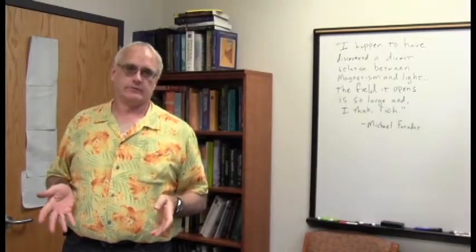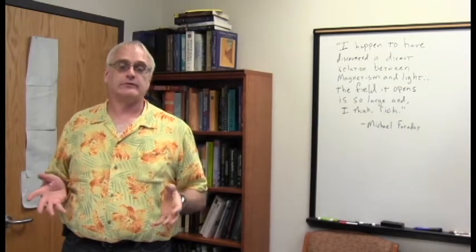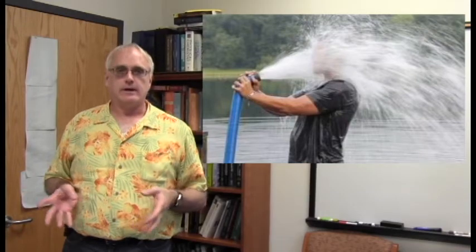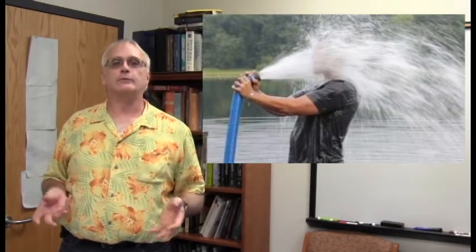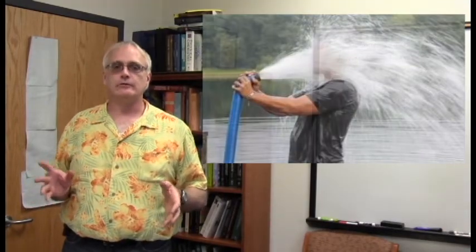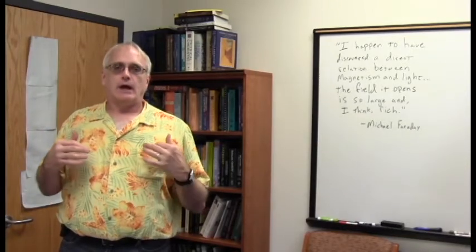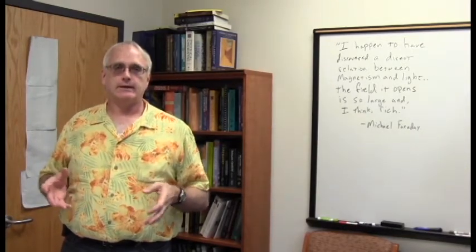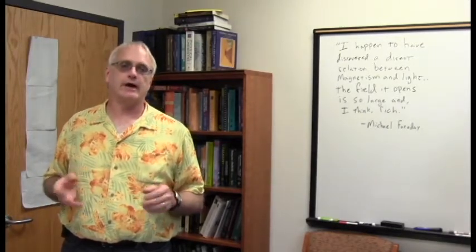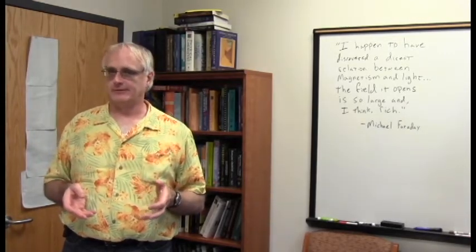One of my favorite metaphors for learning to interpret NMR spectra is essentially learning how to drink out of a fire hose. There's so much information there, and it's sometimes overwhelming. How do you start sorting through it? We're in a position now to begin to really get a handle on how we do this. And so I want to walk you through an unknown interpretation from a set of proton, carbon, DEPT 90, and DEPT 135 spectra, using the skills we've been building up so far.